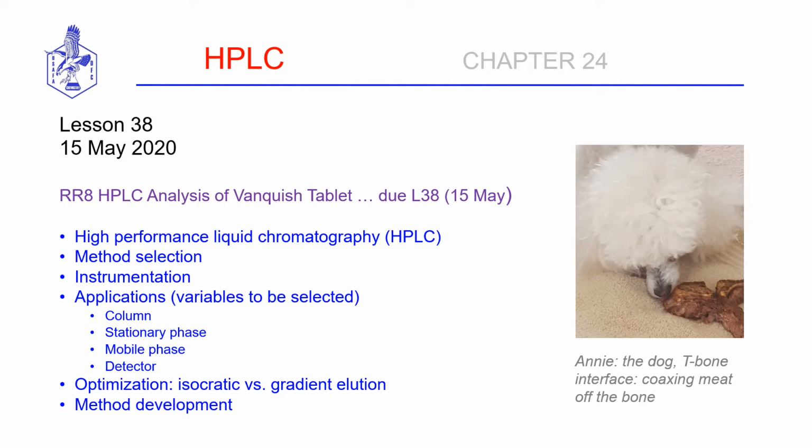So one has to consider, is it feasible to reuse those solvents? And if not, then we have to dispose of them through appropriate means. There could be additional cost involved in the handling of the hazardous waste that does get generated when we do LC.